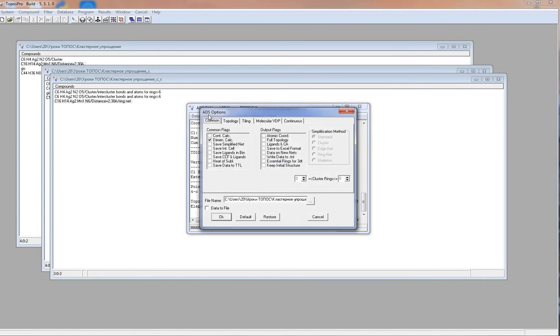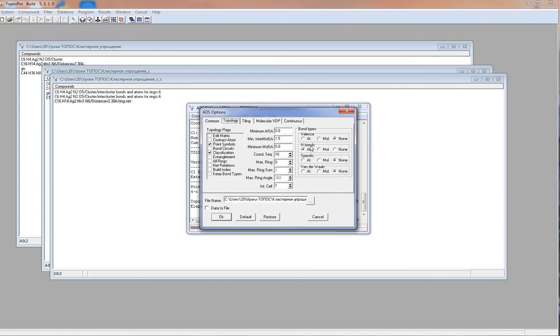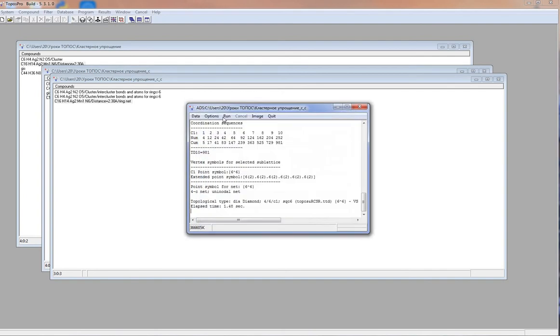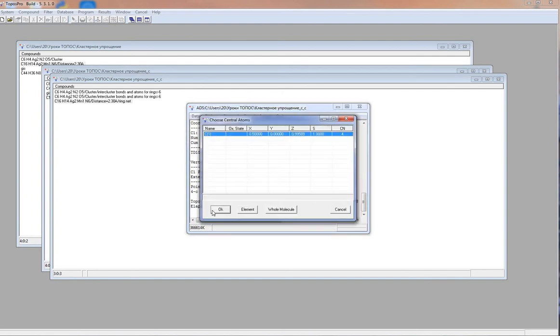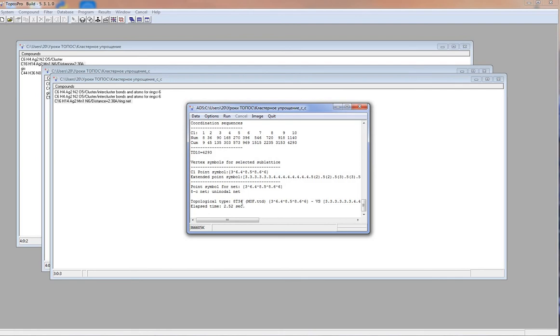ADS, options, topology, valence bonds connect atoms, hydrogen bonds connect atoms. Now we have the 8T34 topology. This is the topology of the whole catenated array of nets.